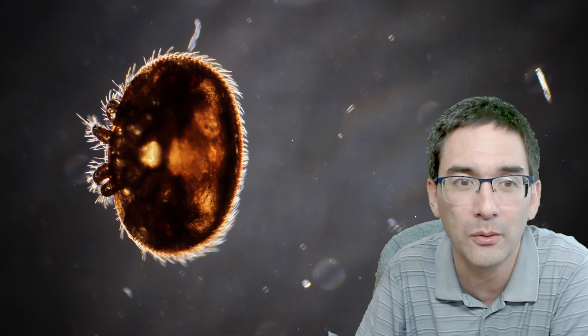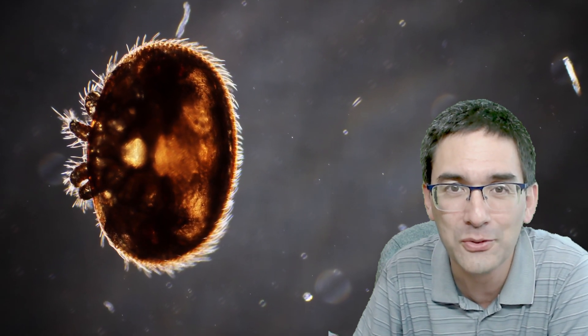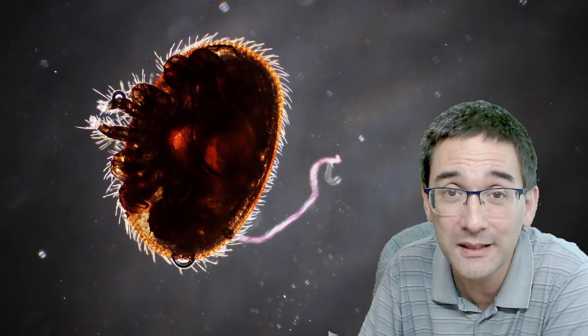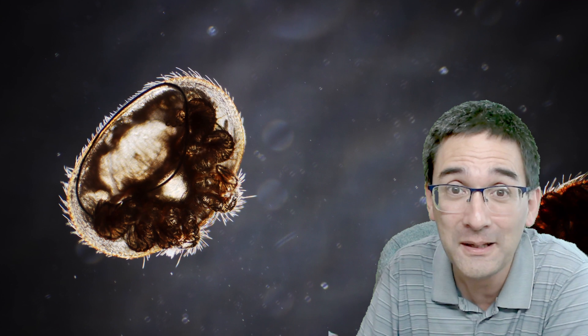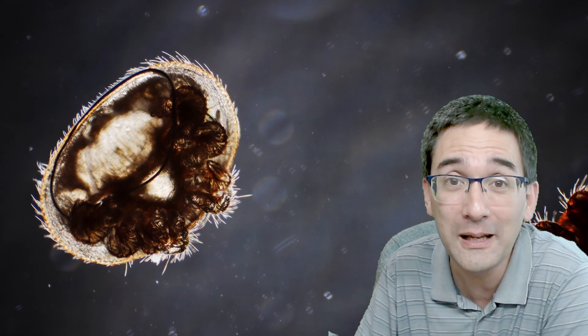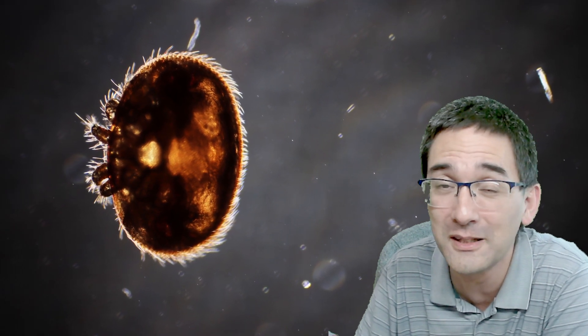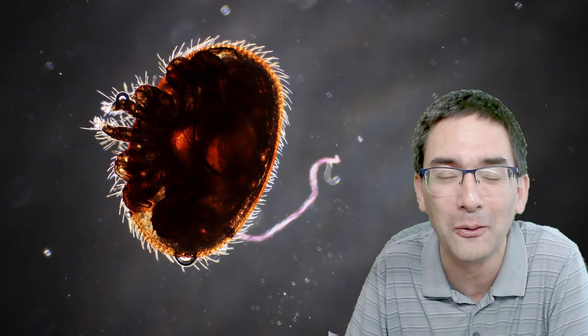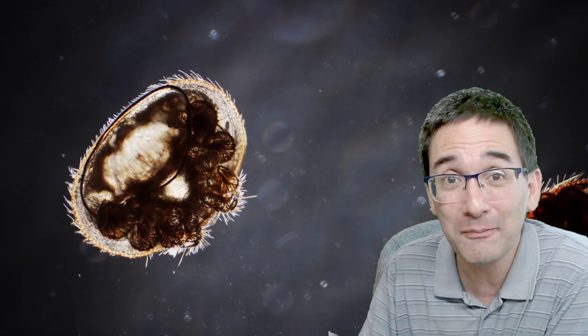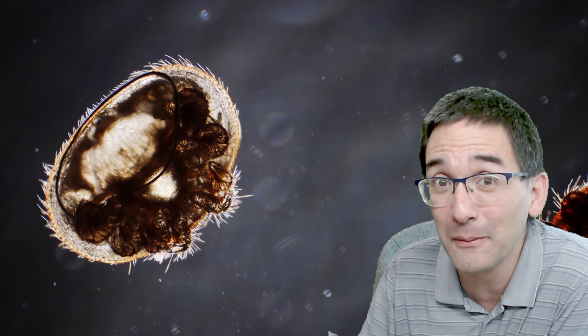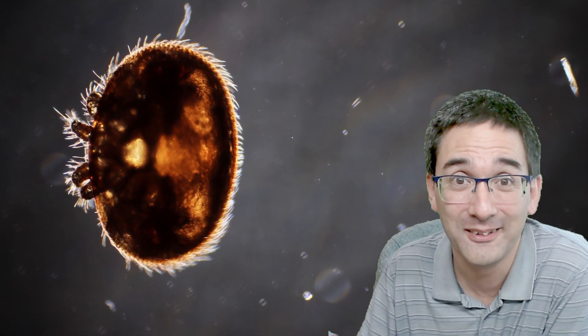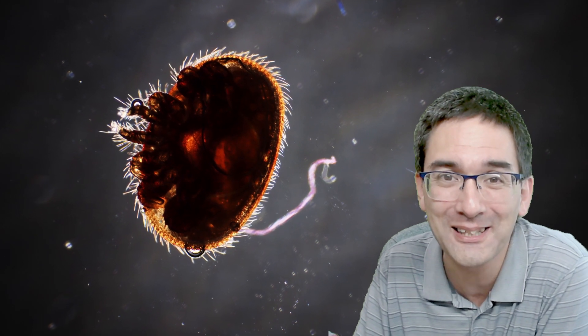Well, this is basically back again where we were - the images I made using my microscope here, using dark field microscopy. Those Varroa mites are quite fascinating. Unfortunately a big problem for those people who keep bees. Do leave your comments behind. I think for today that's all I want to show you. But it's probably not going to be the last time I talk about those mites because I still have a lot of them left on this sheet here. So plenty more opportunities for experimentation. Well, I'm going to leave it at that. As I said, I would like to thank my student who provided me with those mites. Thank you very much, and also thank you for giving me permission to use your videos. And for today, happy micro hunting as always. See you around next time. Bye bye.